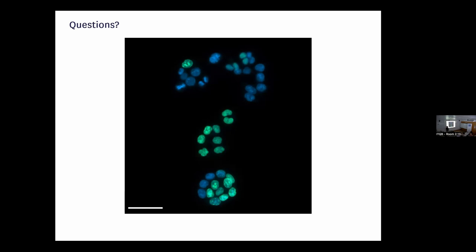Sure, you can. The idea would be to use the same irradiation, the same wavelength, to both damage and bleach, so you could get the dynamics. Sure. You can use a 405 violet laser to induce DNA damage. And if you have a DNA repair protein labeled with CFP, you'll be photobleaching at the same time. So you could then look at the recruitment dynamics.